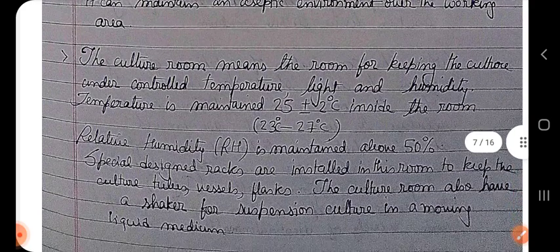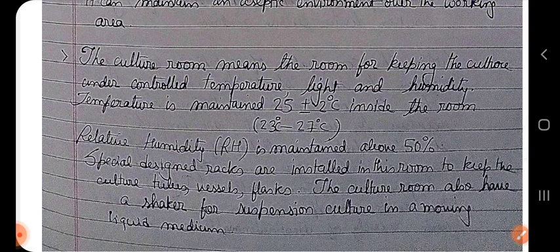Then comes the culture room. As I have said, the culture room is for keeping the cultures under controlled temperature, light, and humidity. Light should be maintained, humidity should be maintained, temperature should be maintained. The temperature should be maintained at 25 plus minus 2 degrees Celsius, that is from 23 to 27 degrees Celsius you can maintain them, not more than that, not less than that. Relative humidity should be maintained above 50%.